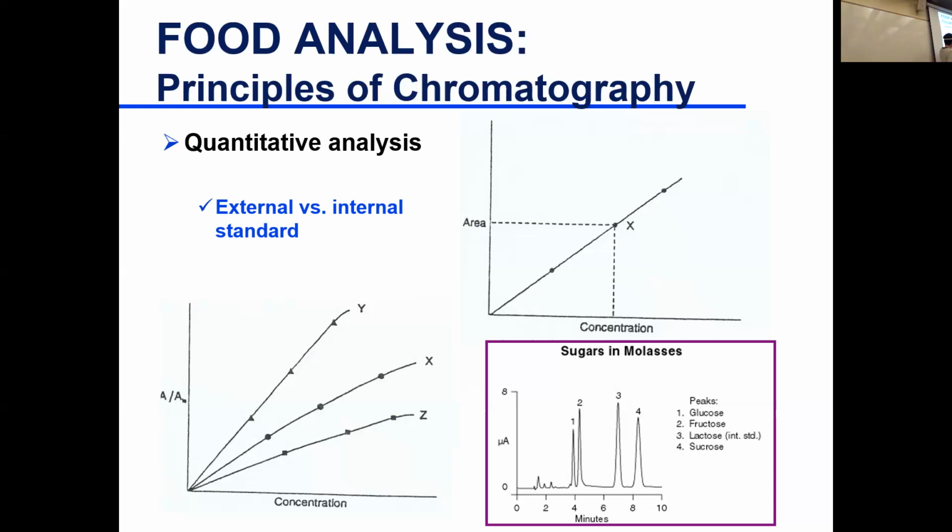Internal standard is important too. We don't use it in simple sample preparation techniques, like you did for the HPLC. It was just different beverages, dilutions. There are not a lot of steps. Take the GC lab, where we have different fatty acids. We want to determine fatty acid composition. There's a lot of steps.